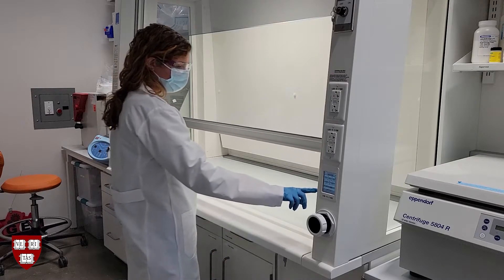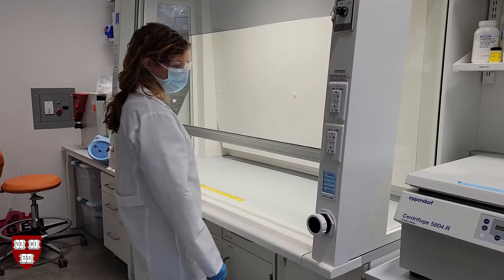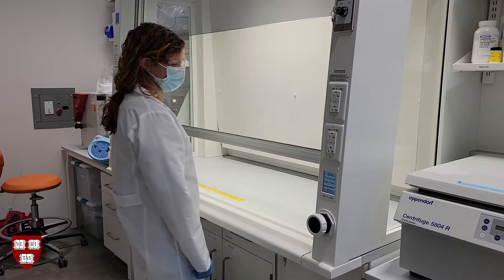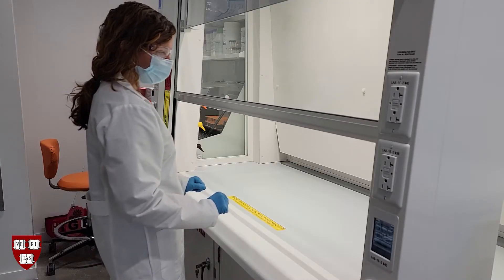To stop the sash from closing automatically, you can press the analog sash open button. Pressing the close sash button on the digital control panel will close the sash fully. For safety, the sash will automatically stop closing if it detects an obstruction in its way.